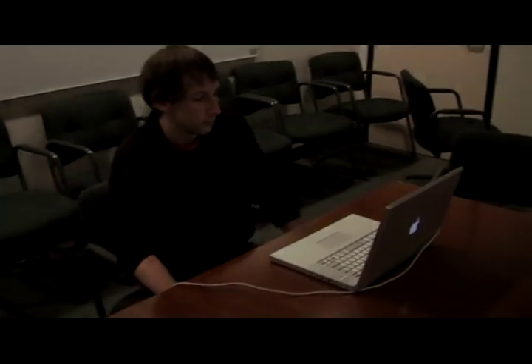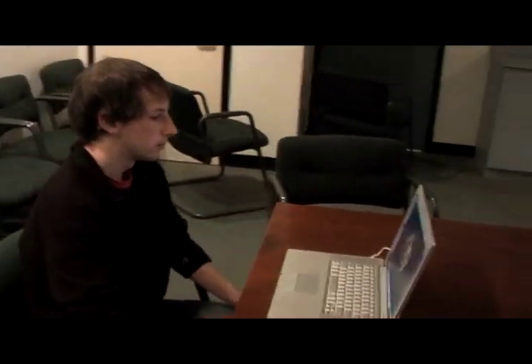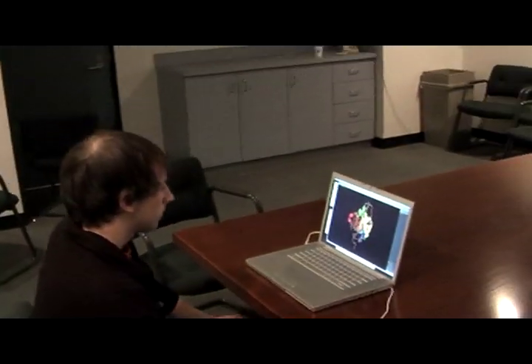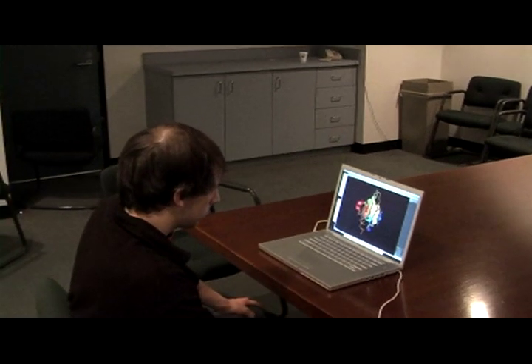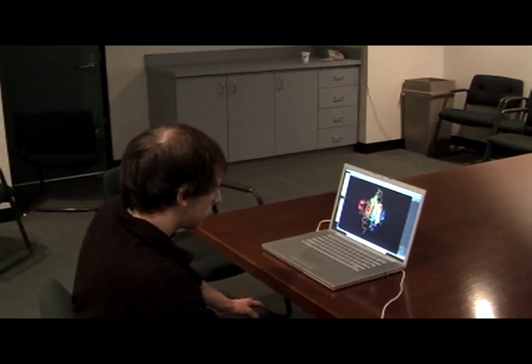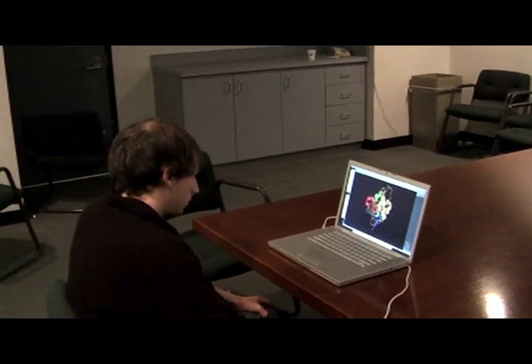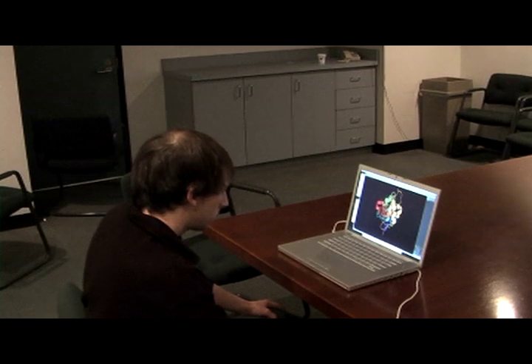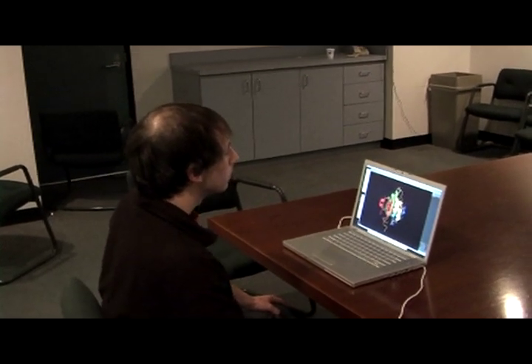Here we show how a user might use our software with the MacBook's built-in webcam. Again, the benefit of this system has to be the cost — anybody with a MacBook already has all of the equipment they need.